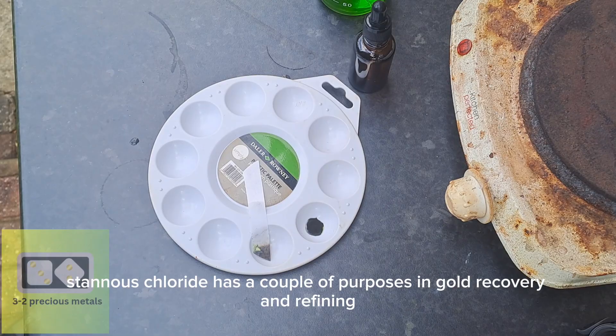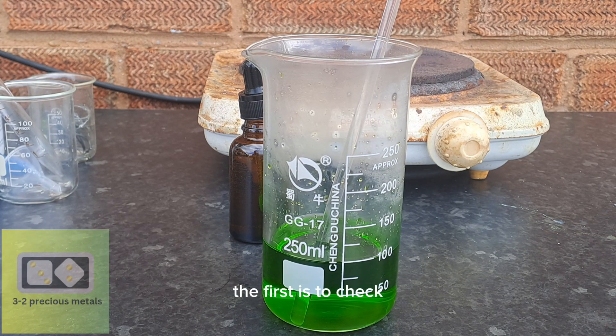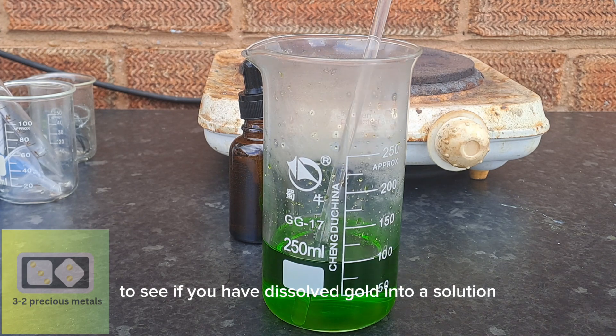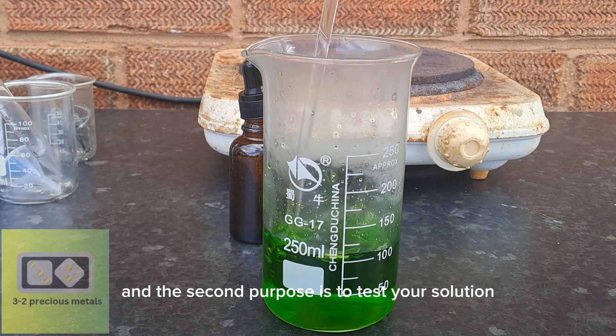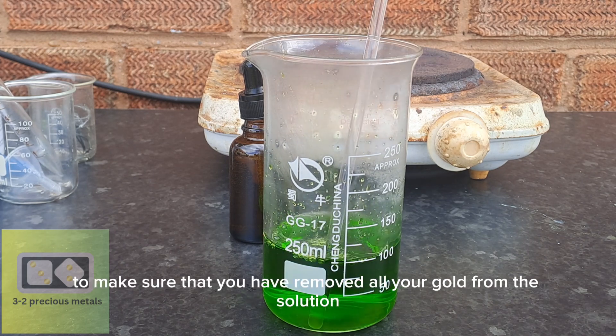Stannous chloride has a couple of purposes in gold recovery and refining. The first is to check to see if you have dissolved gold into a solution. The second purpose is to test your solution after precipitating your gold to make sure that you have removed all the gold from the solution.